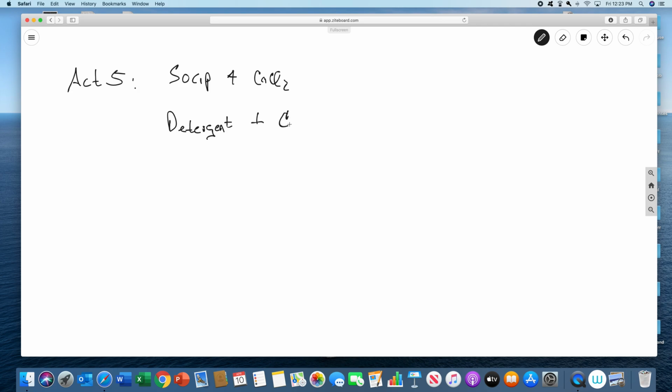Plus, it says in the lab manual Epsom salts, but we would switch it to calcium chloride, right? Epsom salts, just by the way, are the same thing as bath salts, except bath salts have pretty smells, so they add a perfume to it. It's magnesium sulfate. Okay, but what you should see is calcium ions with soaps, right? And detergents are sulfates.